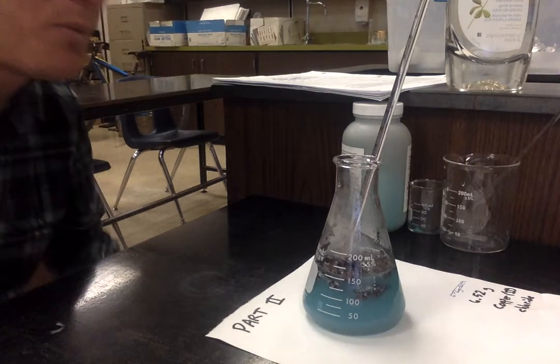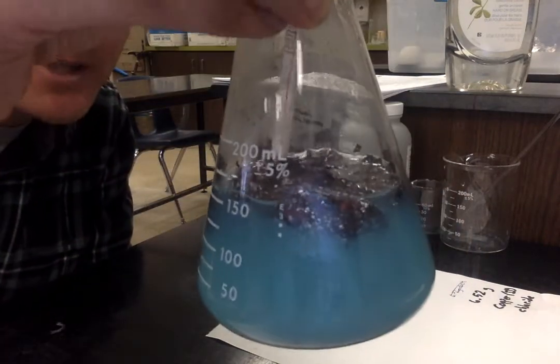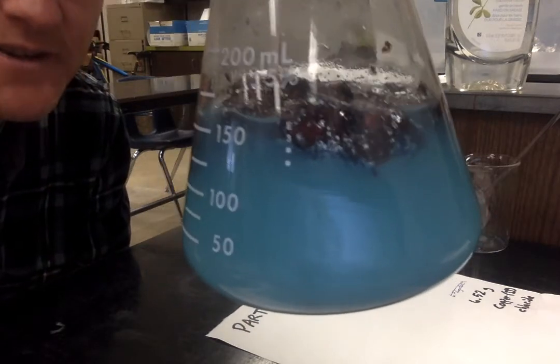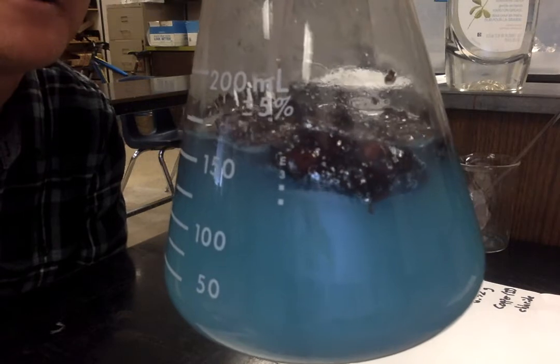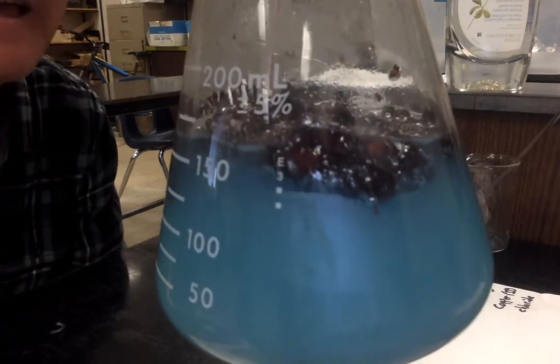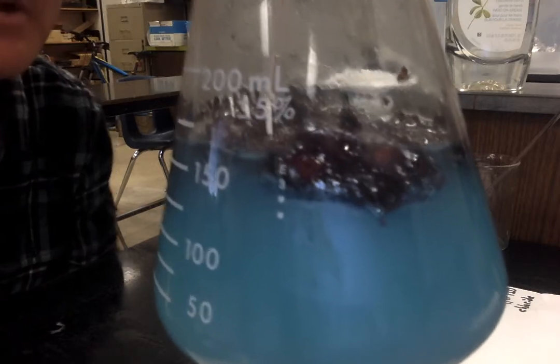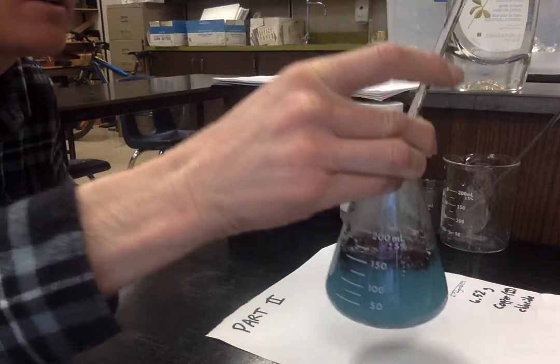Consider making a comparison of the color of the copper solution now. Is it the same depth of a blue color? Has there been a change in the color of the solution? Has the blue changed? How about the foil? Compare the foil before with the foil as it is now.